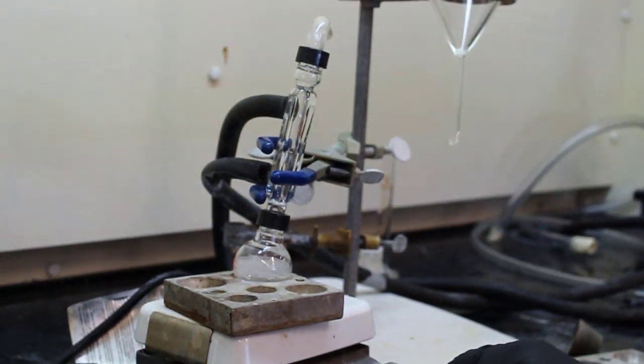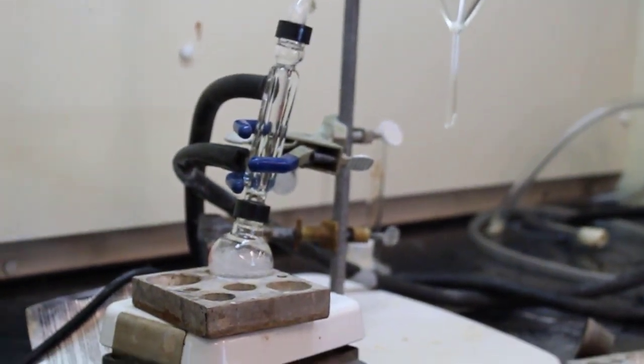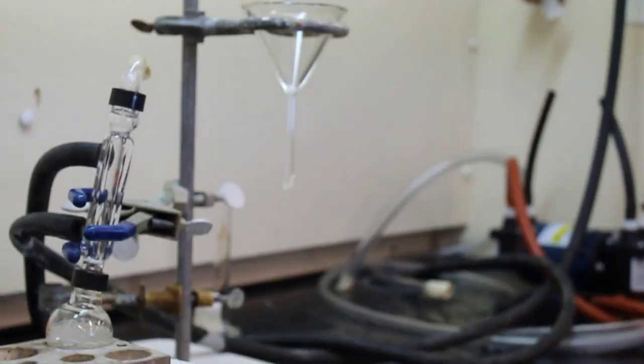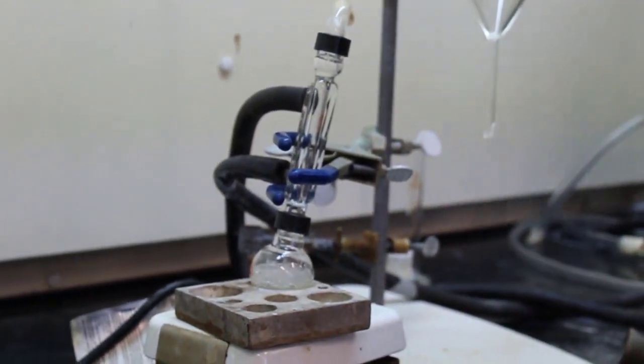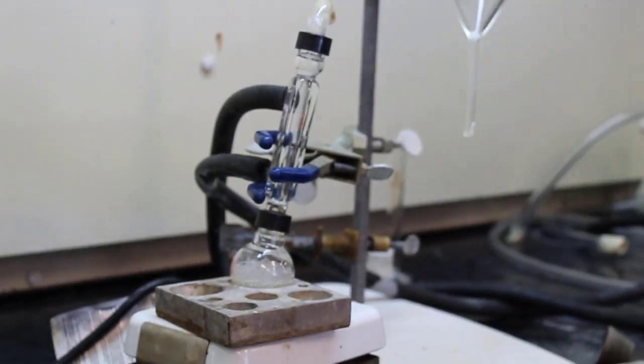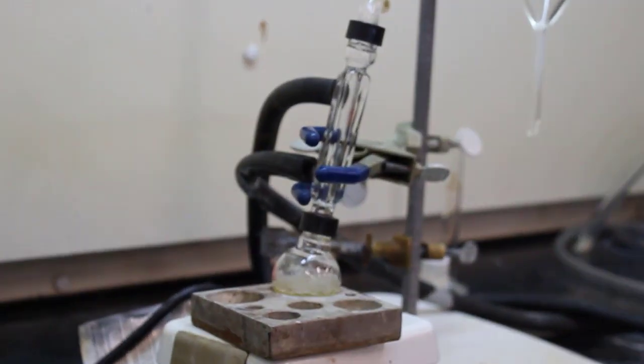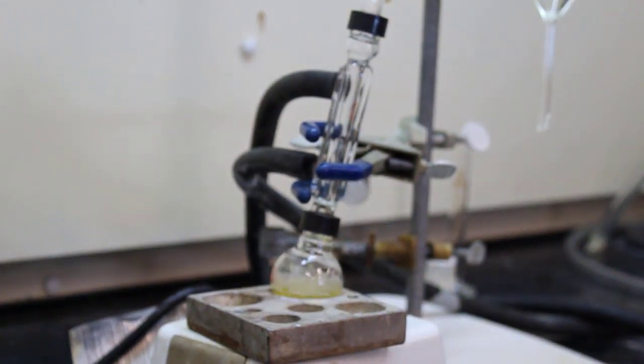They have put the NBS and the triphenylmethane with 15 milliliters of DCM into the round bottom flask. They've put together the refluxing glassware apparatus as described in the procedure — the setup wasn't shown but it's already assembled.